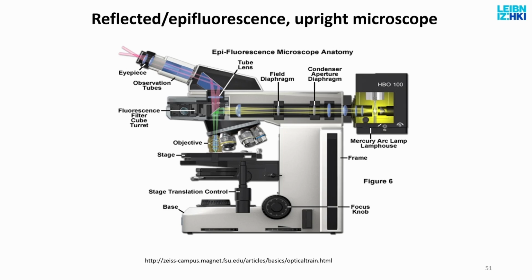So down here in transmitted light mode, I would need a second lens as good as the first one. Otherwise, I will ruin my total resolution. So in reflected light mode, I can use one expensive lens and have the maximum resolution. In transmitted light mode, where I would illuminate the same way but pick up the signal here, I would need a second very big lens, or else give up some accuracy. Because of that, transmitted light images will have lower resolution than reflected light or fluorescence.